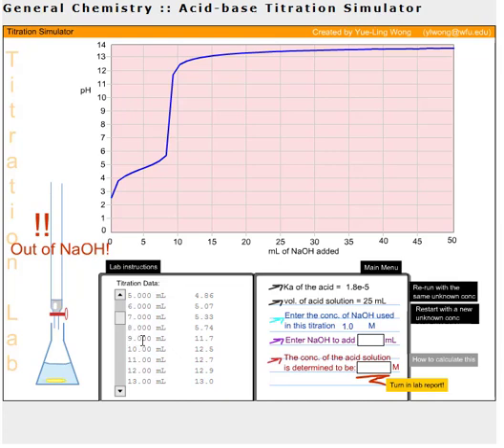So right here between 8 milliliters and 9 milliliters is where we go from 5.74 acidic to 11.7 basic. So in that milliliter is where that equivalency was reached and the pH 7 neutral was hit upon. So that's a spread of about 6 units. And so halfway would be about a pH of 8, which is going to be very close to our endpoint there. So we'll go ahead and take the average of those two.